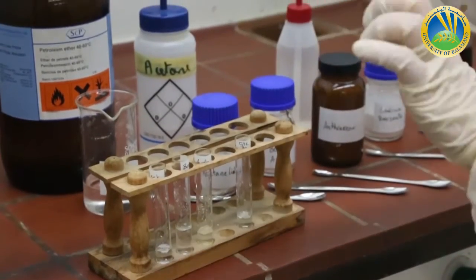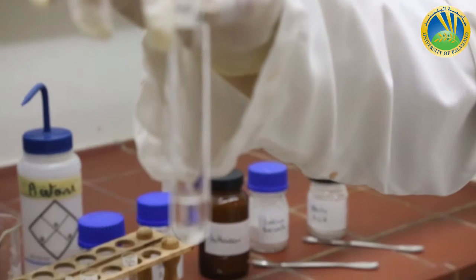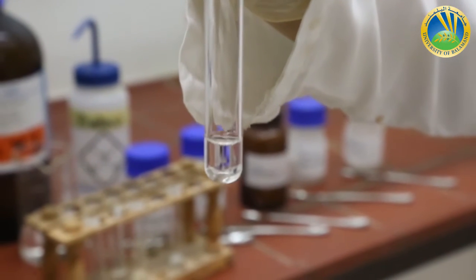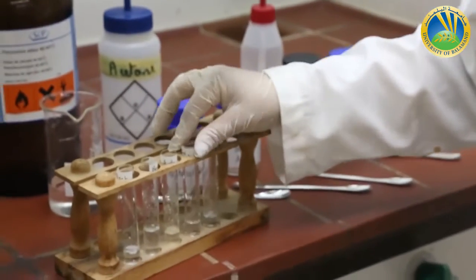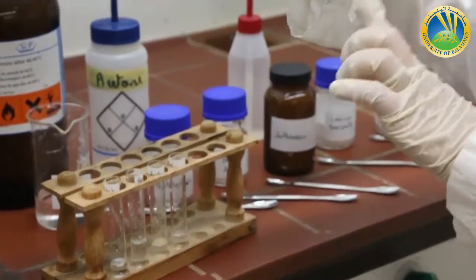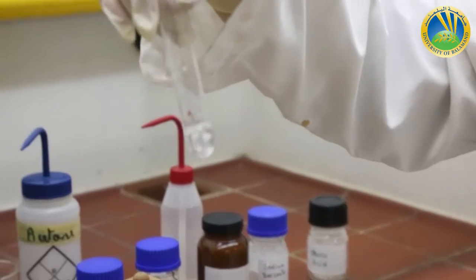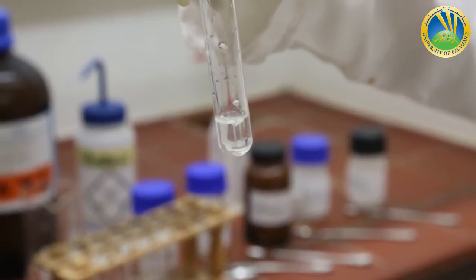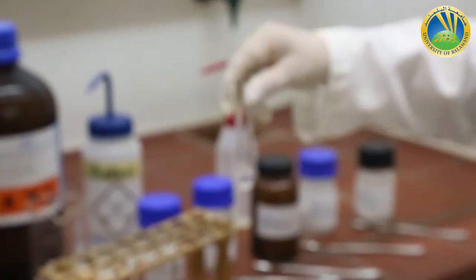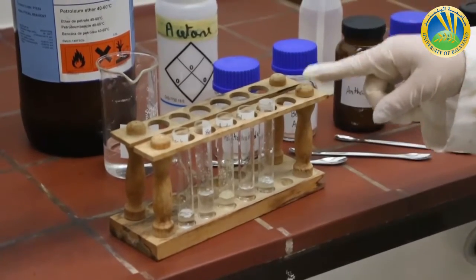Sodium benzoate inside water, I see no crystals inside. So sodium benzoate is totally soluble inside water at room temperature. Stearic acid, big crystals are still inside the tube, so it's not soluble at cold. Now I have to test the solubility at hot near the water bath of water that is at 100 degrees.